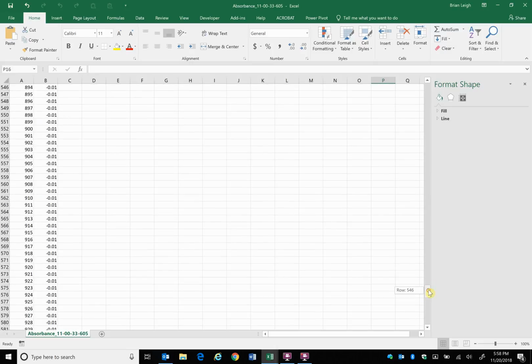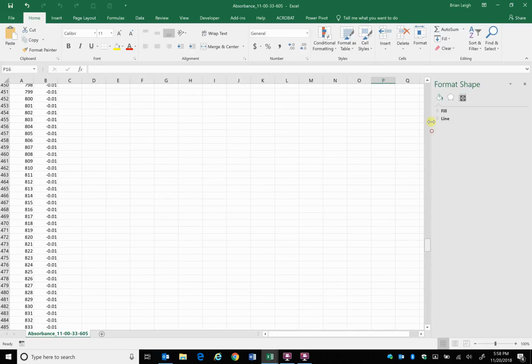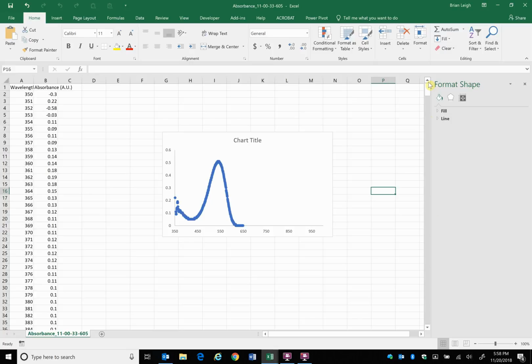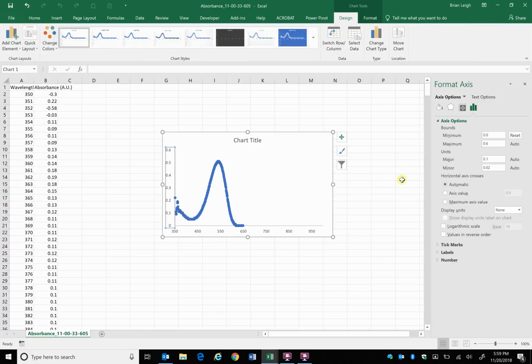And so the problem here is our blank is a little bit negative, maybe because of orientation to the cuvette or just some small change between putting your sample in and the blank. And that's okay. So you can adjust for this tail going out here in a couple ways. You could do it by actually showing a little bit below the line. I normally don't like doing this because it just looks not professional.